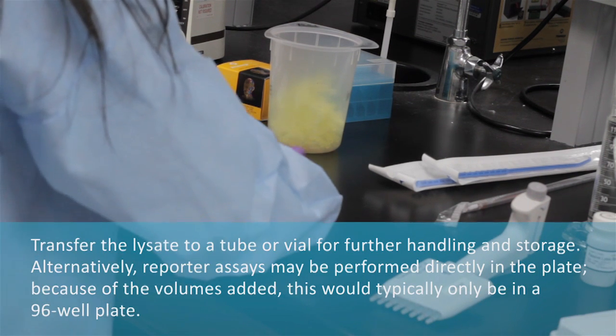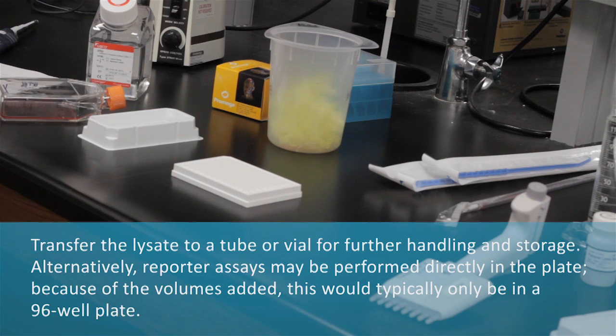Transfer the lysate to a tube or vial for further handling and storage. Alternatively, reporter assays may be performed directly in the plate. Because of the volumes added, this would typically only be in a 96-well plate.